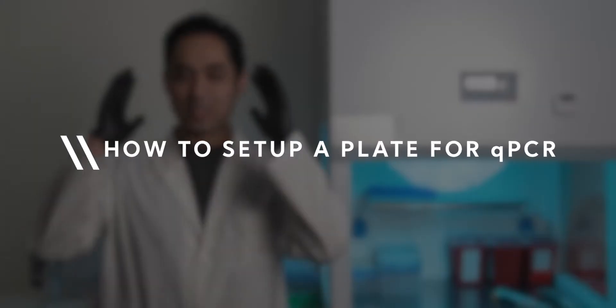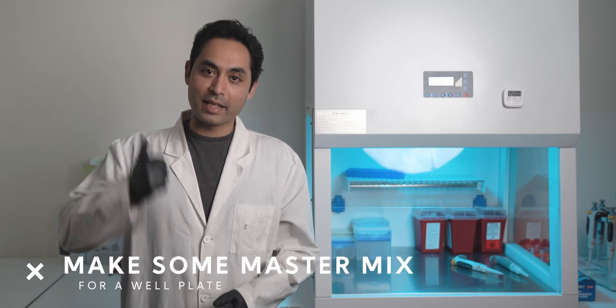Today we're going to talk about setting up a plate for qPCR. For a well plate, the first thing you're going to want to do is make some master mix.